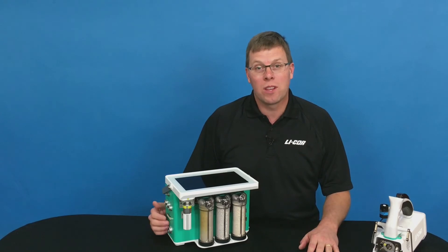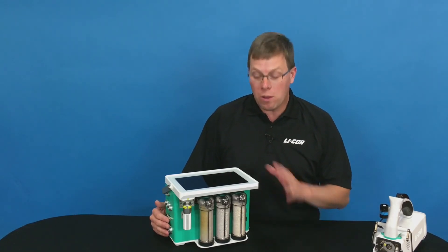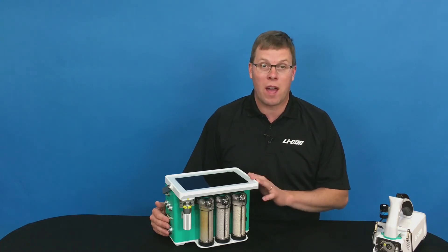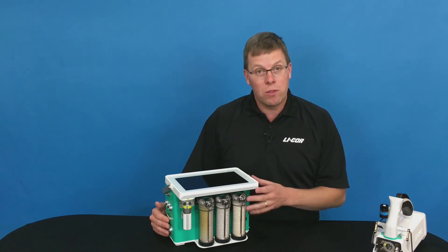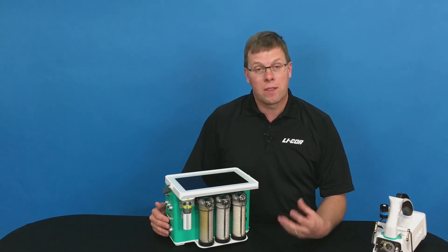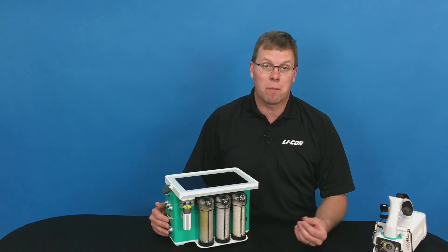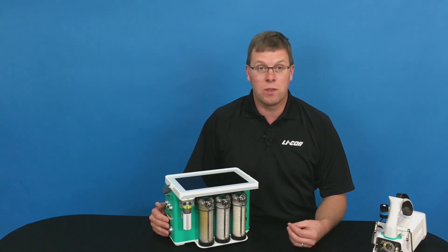For those of you who have used the 6400, you may be asking about the fuses. On the new 6800, there are no fuses that you ever have to change. There are fuses inside the system, but they're thermal reset fuses — if there's a fault, the fuse opens, and once it cools back down it resets itself automatically, so you never have to change those fuses out.